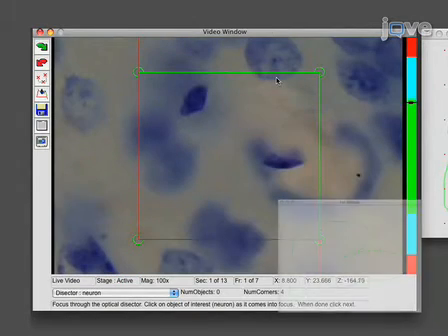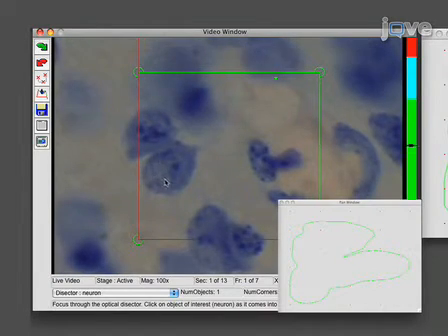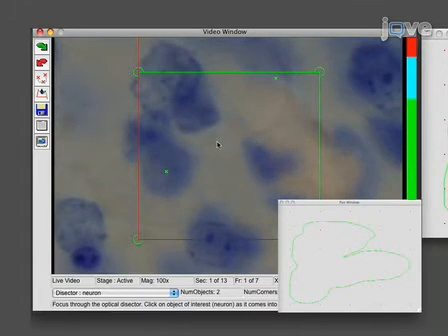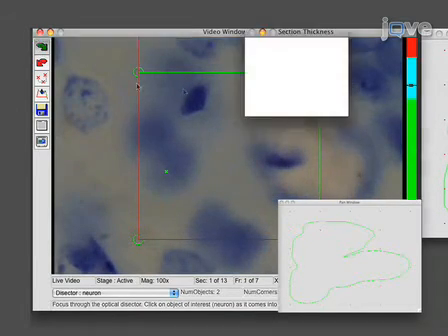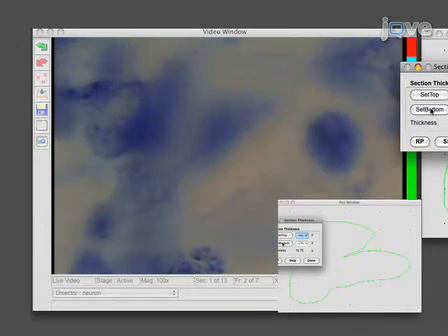To determine the measured thickness, focus through the Z-plane until the first cell comes into focus, then back up slightly to the top of the section until the last object appears just out of focus. Then, to find the bottom of the tissue, focus through the Z-plane until the cells are barely out of focus. While focusing through the Z-plane, note that the cells should be stained at every depth. If not, this may indicate an incomplete penetration of the stain or non-uniform dehydration of the tissue, in which case the sections should be restained.